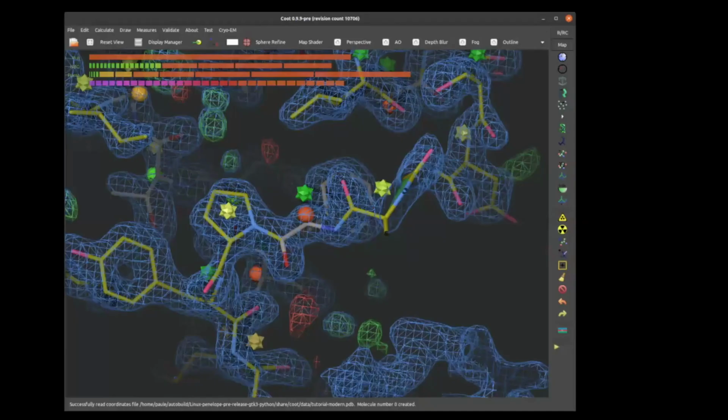So first of all, we have balls and dodecahedra, or stellated dodecahedra. And the balls represent the probability of the Ramachandran plot. And the dodecahedra represent, which is kind of embedded in the sidechain to some extent, the probability of the rotamer. So the idea is that we want to move the representation style to green. So this is as it was in the 0.9 version of Coot.